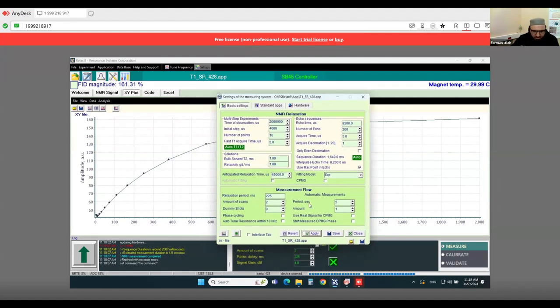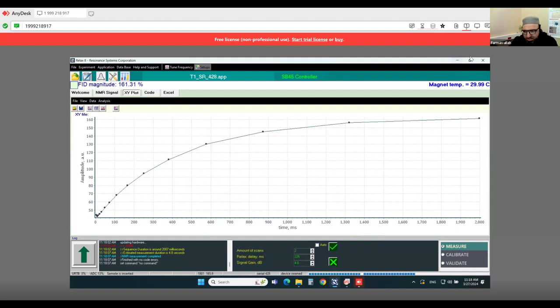Sorry, I need the fitting curve here to show something about the amplitude. So I will restart my setup. This sometimes needs a refresh; it happens with software.